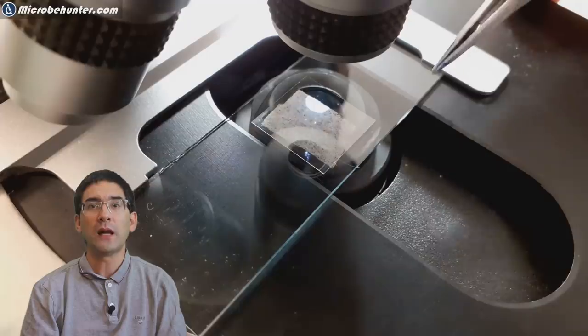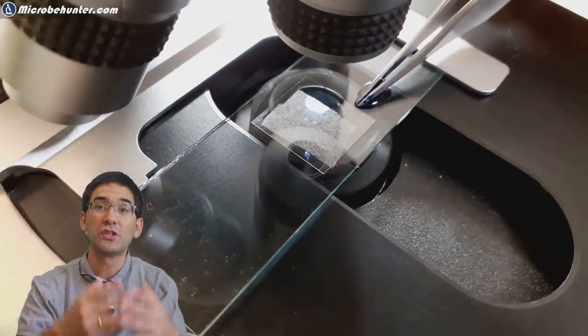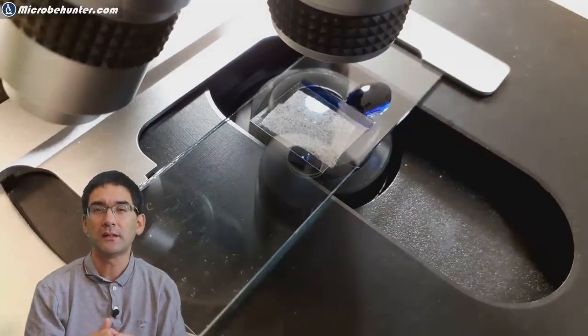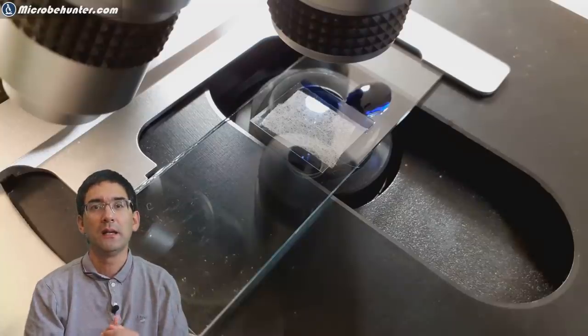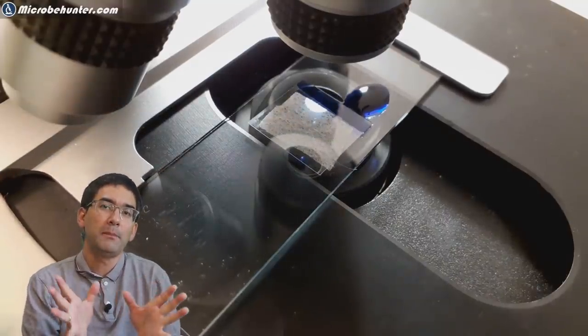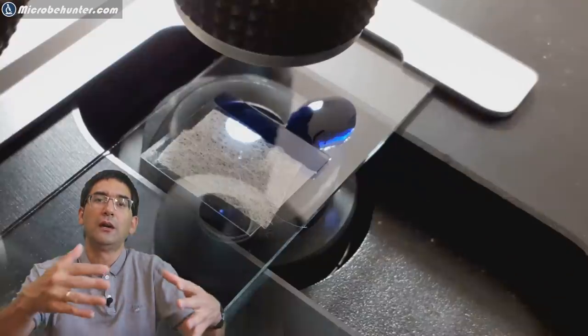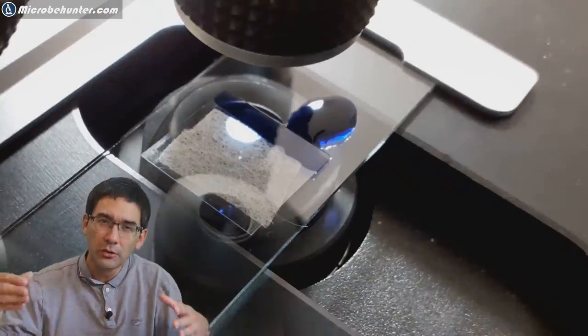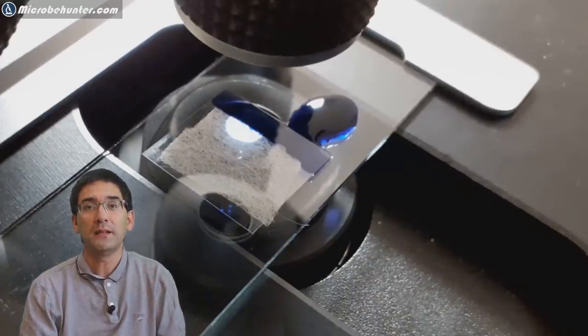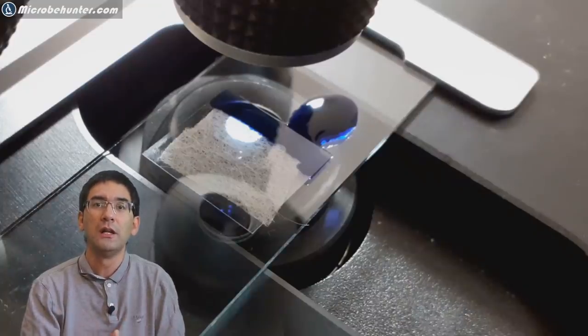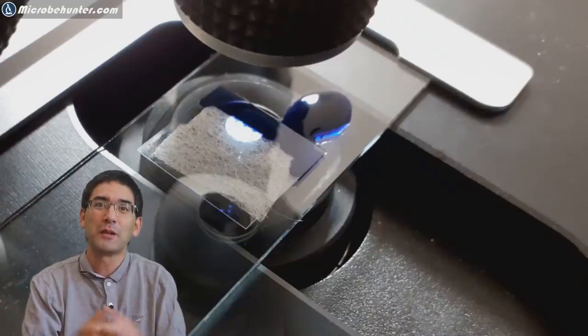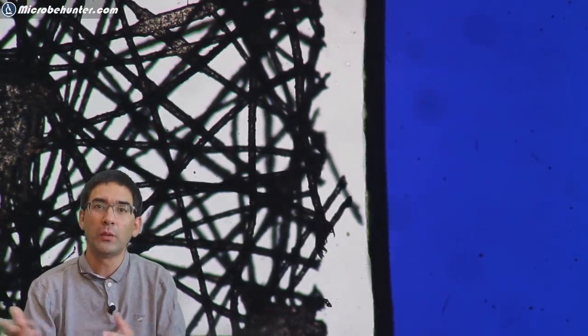I tried to now add a little bit of ink simply because I wanted to see if these fibers also stain. It's a water-based ink. I immediately realized something quite interesting, namely that the fibers really did not like to absorb the ink. They did not like to take it up. Essentially what happened is that the ink kind of moved around the tissue, but it did not really go into the tissue. Here you can see how the ink is moving forward.